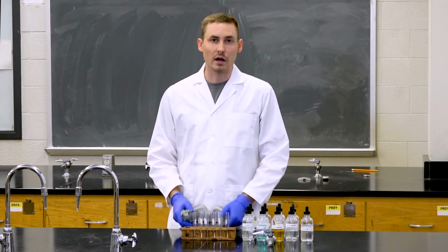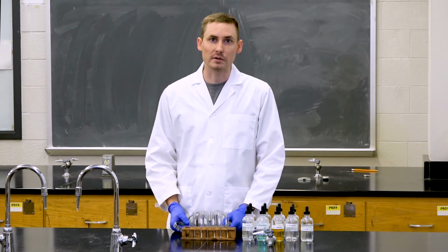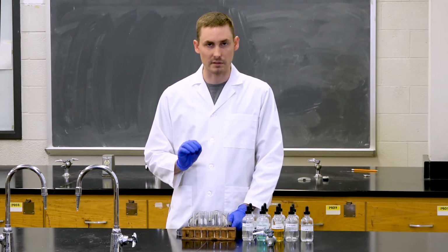this lab. Also in this lab, when we use ammonia hydroxide later, there will be strong fumes of ammonia produced, and we want to make sure that we don't smell the test tubes or be too close to the test tubes, as it might be kind of an irritant for your nose.